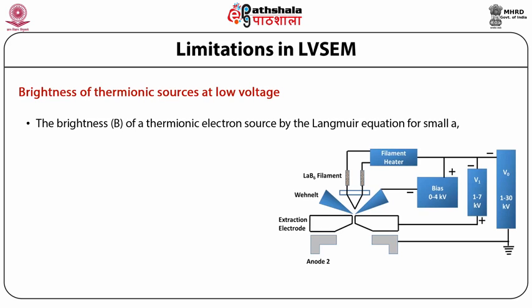The effect of spherical or chromatic aberration on spot size can be minimized by reducing the acceptance angle of the final lens until the lens becomes diffraction limited. In an instrument with conventional tungsten sources, the image becomes too noisy for convenient use when reduced to the diffraction limit.